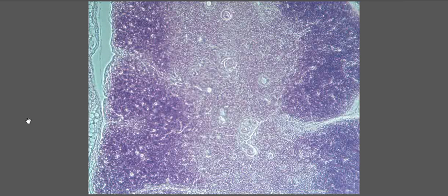It's the thymus. Now, in the thymus, we have to define lobes, right? But what is this? Lobe? Look at the figure that you have for the thymus. What does it say? The cortex, right? And this one will be what? Okay. All right, so that's the thymus.